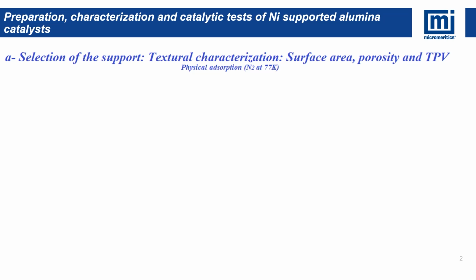And the total pore volume is the volume taken at the maximum relative pressure on the adsorption isotherm, and this volume is taken into account when we prepare the catalyst, as we will see later.